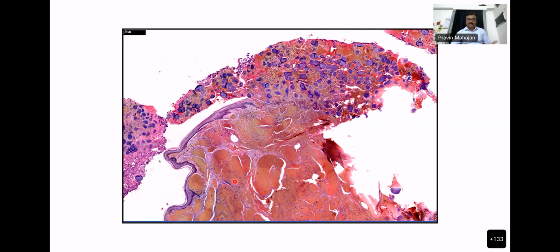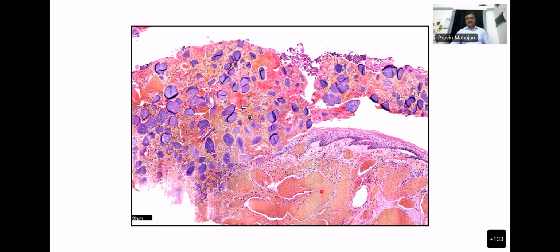Now, when they did an excision, you can see large blood-filled spaces or vascular channels within the scalp, which you can make out is like a cavernous hemangioma. But what is interesting is that on top of the skin, you can see something which looks like round or rectangular bluish particles. On high power it definitely looks like a vascular lesion, and on top of it there is something you have never seen in histology or pathological sections, something round, rectangular or irregular shaped.